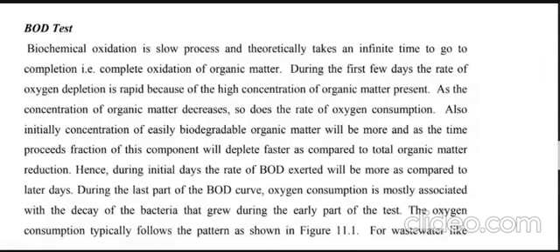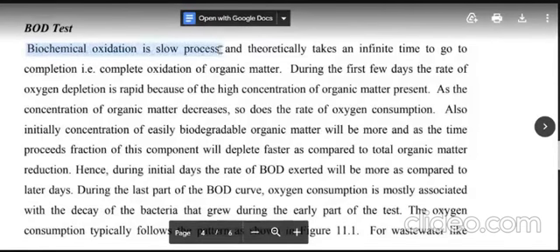Now, what is the meaning of this? Why do they require infinite time? Because you don't know whether all the oxygen is consumed by the bacteria or not. We put the bottle into the incubator, and we wait for some 5 days, 7 days, 10 days, maybe even 20 days. There is a 20-day test too, and from that we get a certain result.